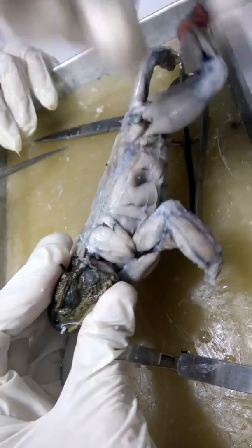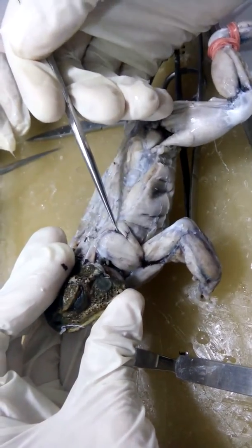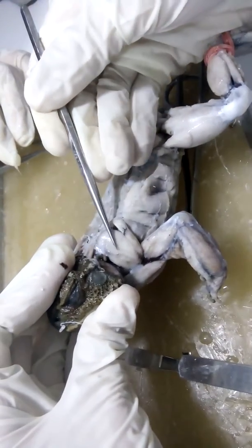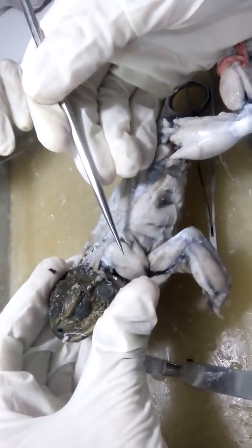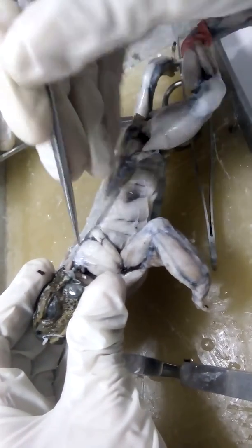Posterior to that, we can see here a very big bulky muscle attached to your suprascapula. This is your dorsalis scapulae attached to your suprascapula.